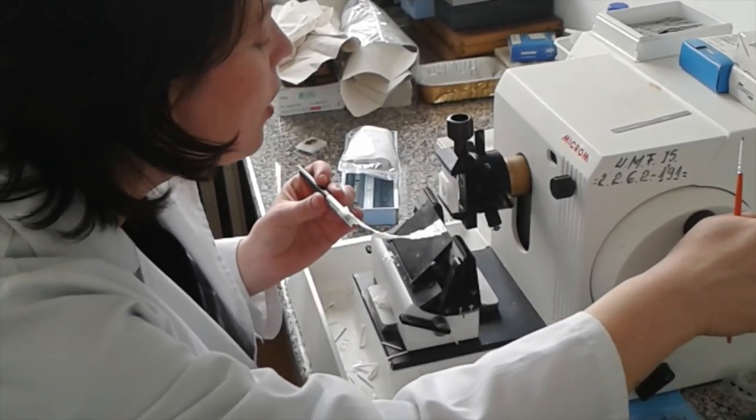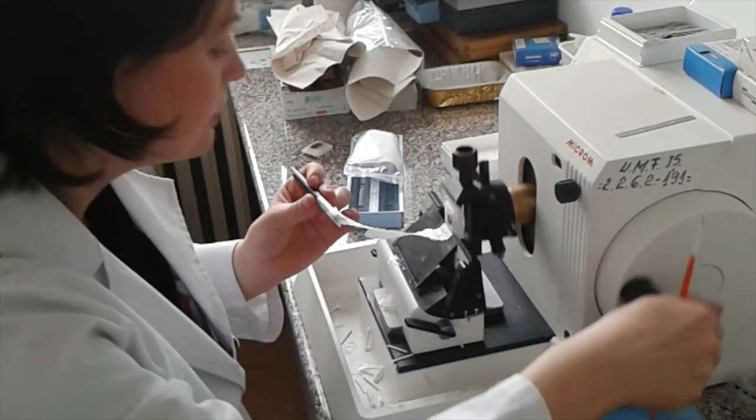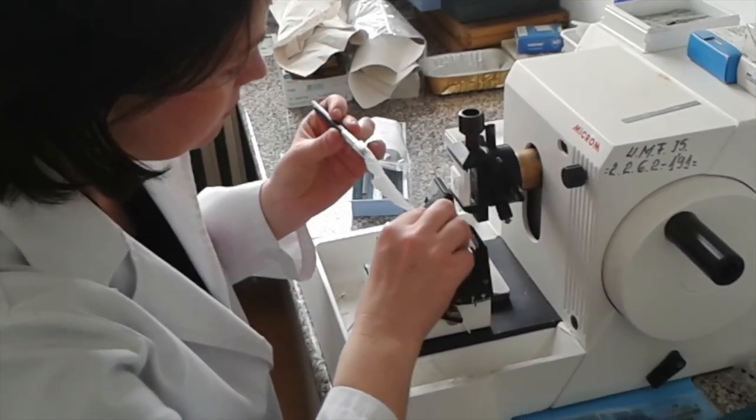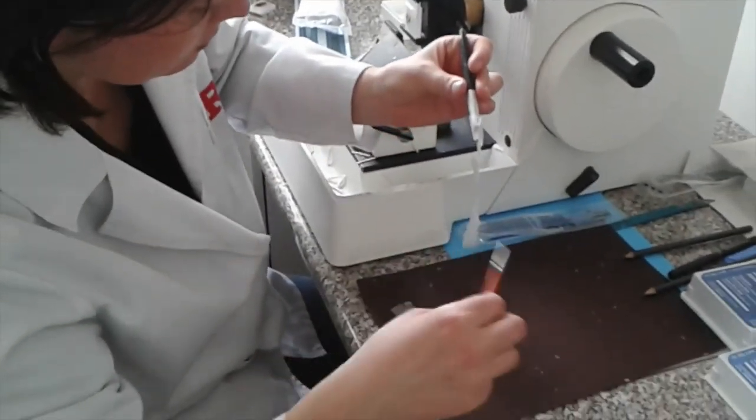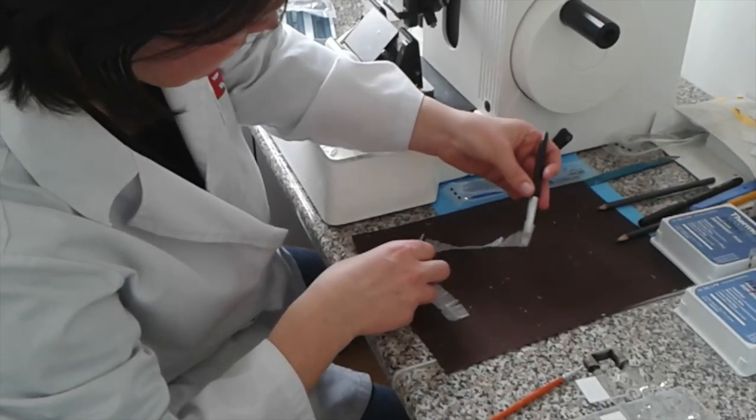After the fixation and the embedding steps, the next step is sectioning, that is we must cut thin slices of the samples in the microtome. The sections are usually about 3 or 4 microns thick.